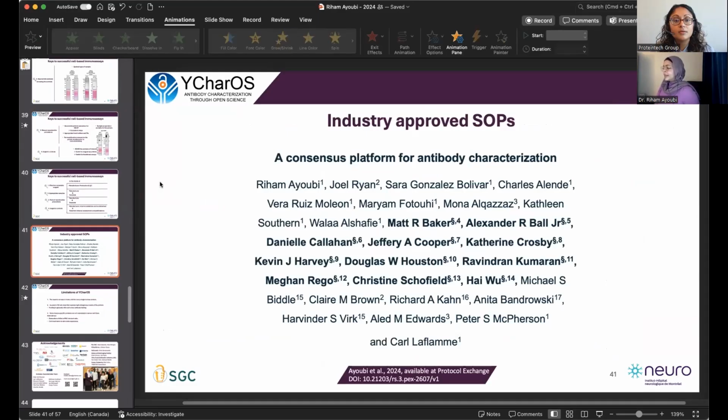The answer is I can't answer for every single human protein because we haven't used that protocol for every single human protein. However, for the subset of targets that we worked on so far, yes, these universal buffers, a denaturing buffer that's SDS containing for Western blot, because we're working under denaturing conditions, and a non-denaturing buffer for the IP, where you would want to capture the native protein. Yes, these have been successful so far.